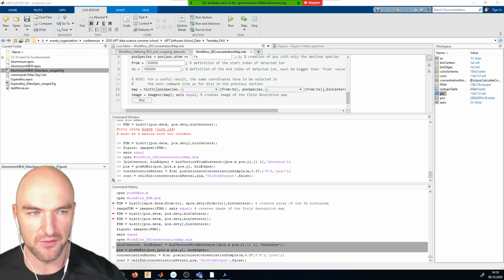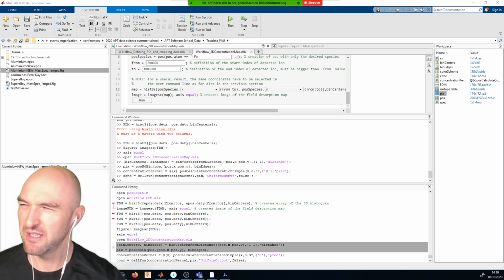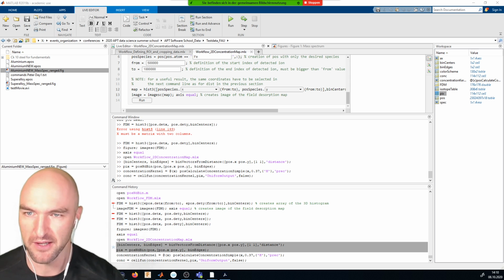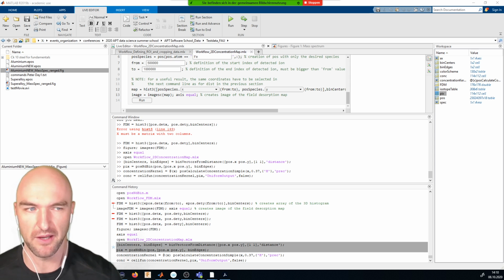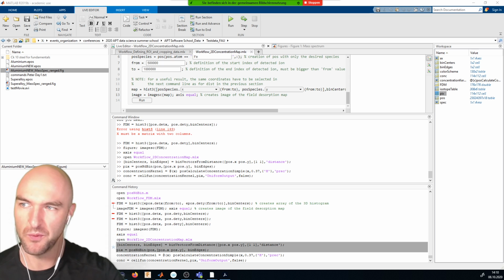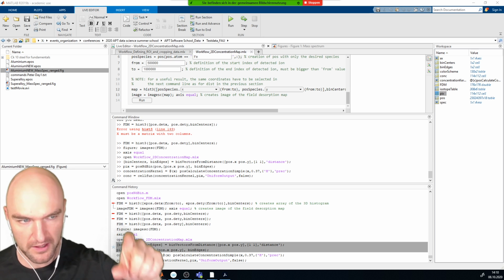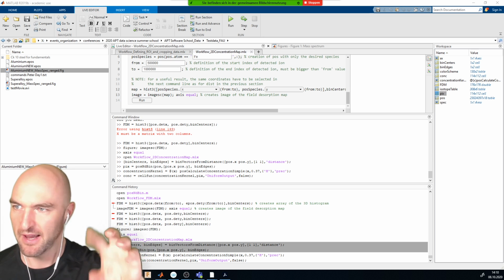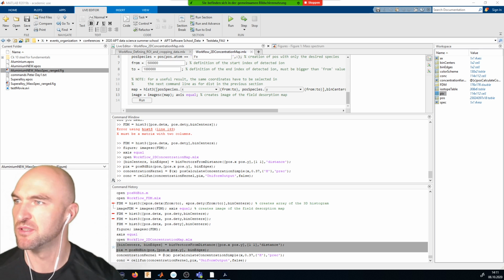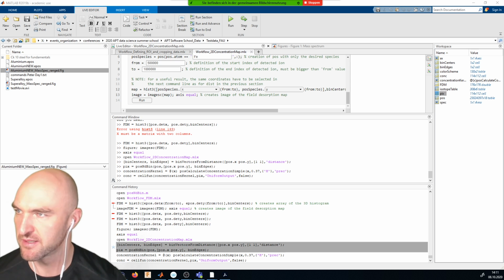The problem with that, of course, is we would actually, yeah, now that I think of it, we could implement a weighing function so that once we do the voxelization, for each POS file we assign the atom to all neighboring cells and give it a certain fraction with which it belongs to a certain voxel. So that's actually pretty doable.